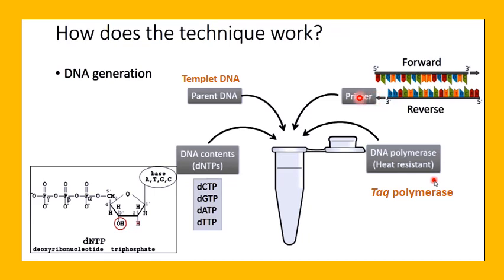This one is directed in this direction, and this one elongates the DNA in that direction. From this, shorter pieces of DNA are formed, at which the elongation of DNA continuously occurs.